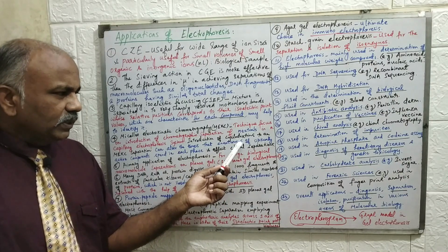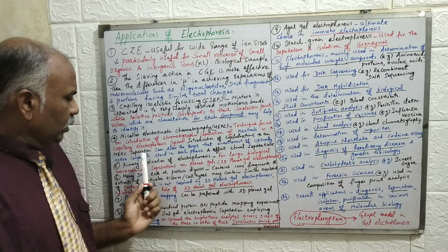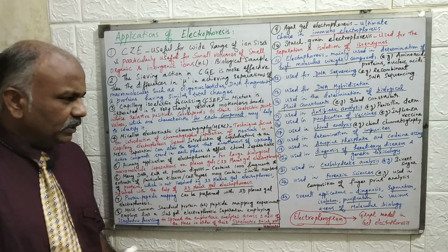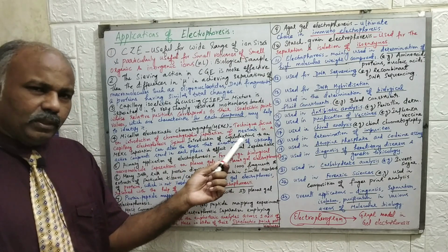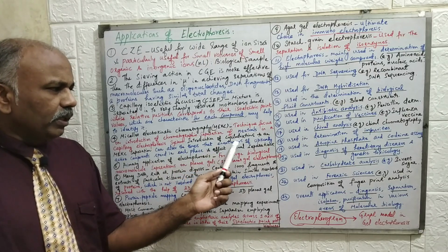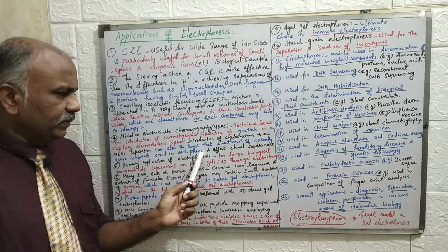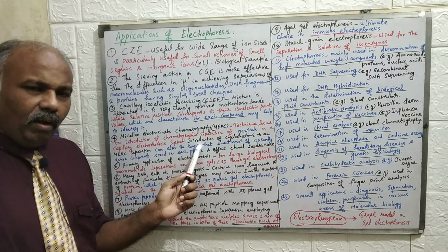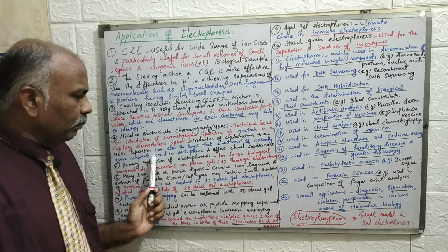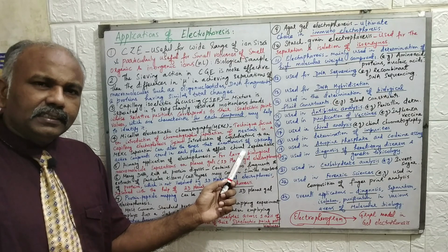So then the introduction of cyclodextrins. If you introduce the cyclodextrin to an MEKC separation, they change the times that enantiomers of optically active compounds spend in each phase, and affect the chiral separations.